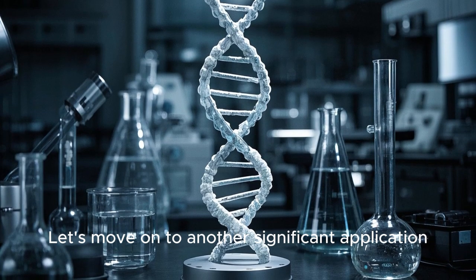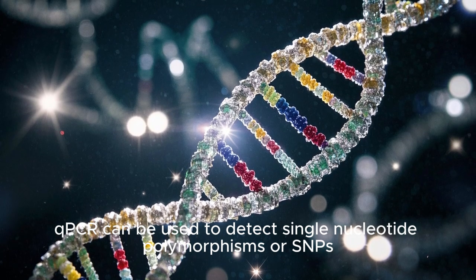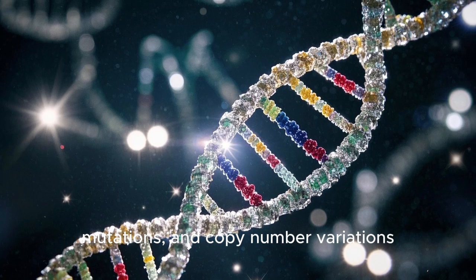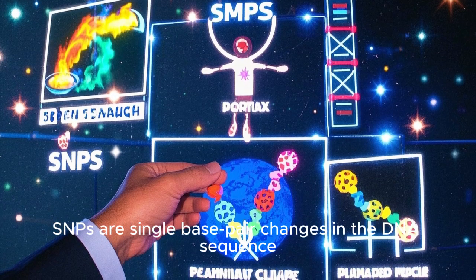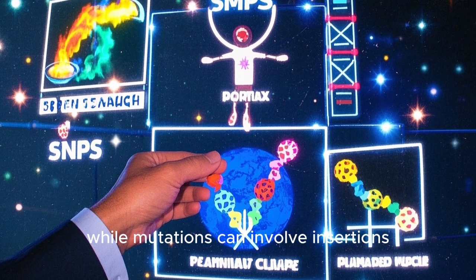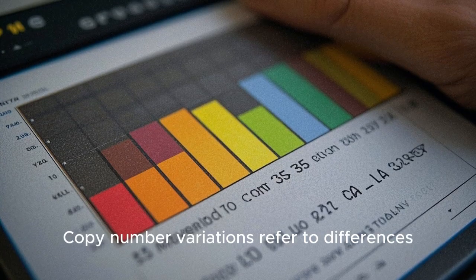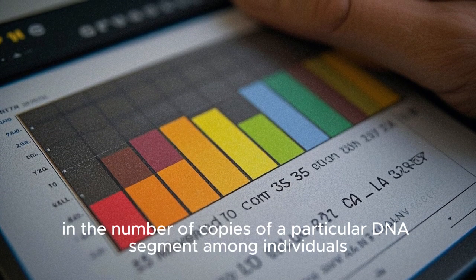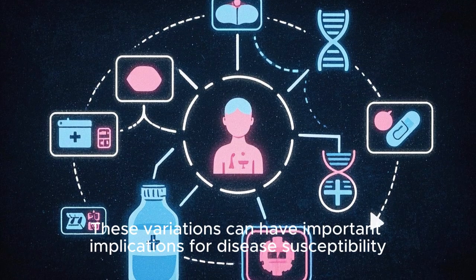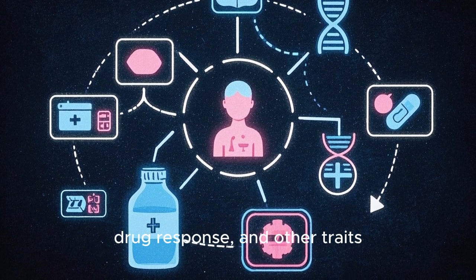Let's move on to another significant application: genetic testing. qPCR can be used to detect single nucleotide polymorphisms, or SNPs, mutations, and copy number variations. SNPs are single base pair changes in the DNA sequence, while mutations can involve insertions, deletions, or substitutions of larger DNA segments. Copy number variations refer to differences in the number of copies of a particular DNA segment among individuals. These variations can have important implications for disease susceptibility, drug response, and other traits.